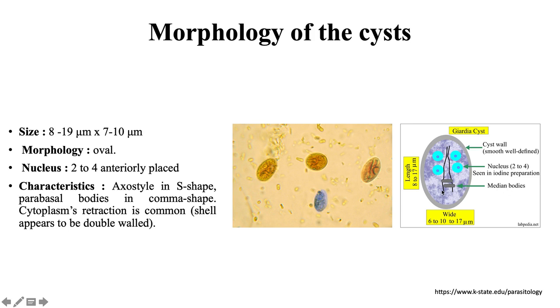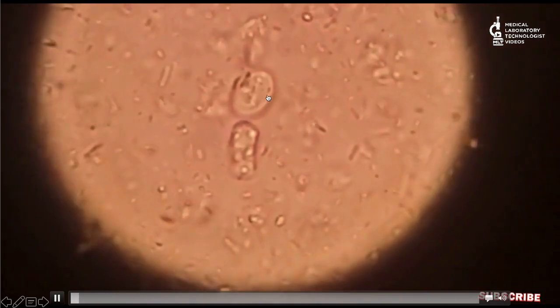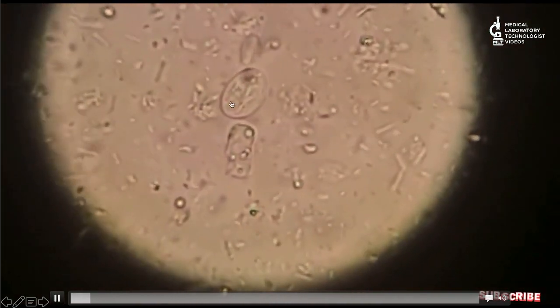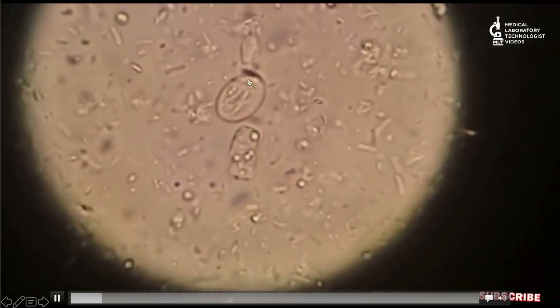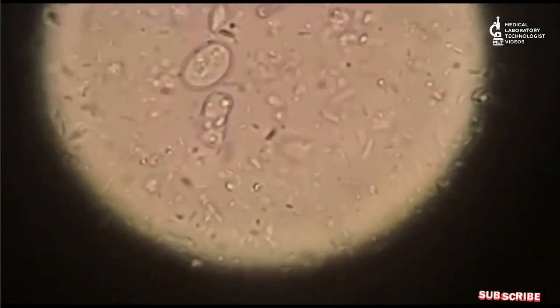So let's see the cyst under the microscope. Here is the video. This is the cyst under the microscope. هذا شكل الأكياس أو السيست، طور السيست under the microscope.